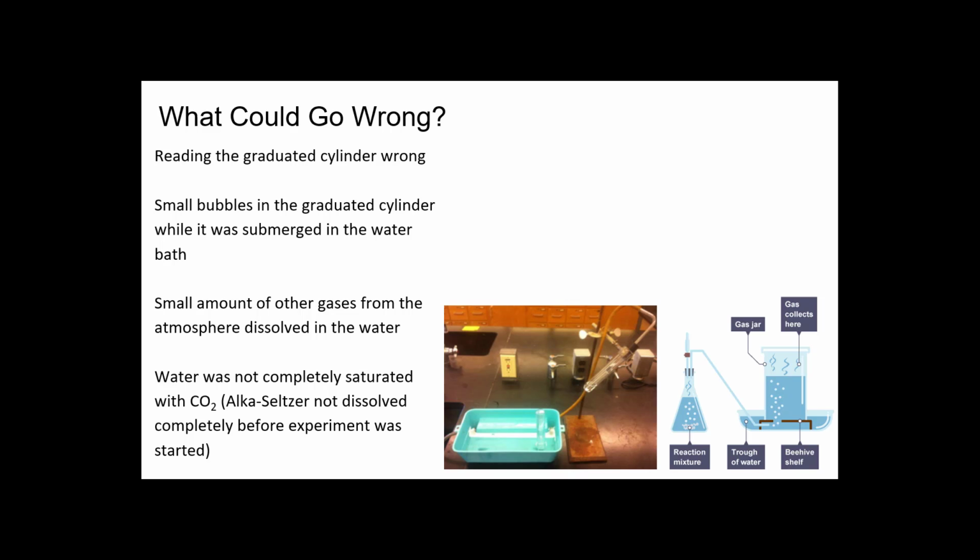That way you know that it's been saturated, and the CO2 that you're collecting is going to be as correct as possible because it's not going to go into the water. So that's some of the problems here. And that's about it.